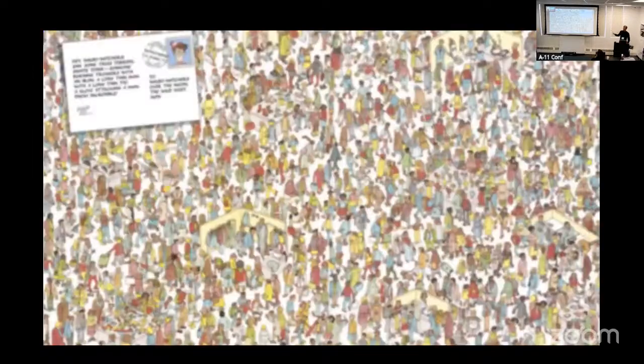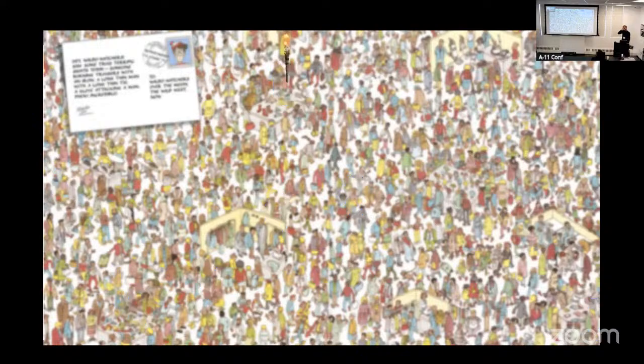So you're doing this. I always put Waldo in my slides. One way or another, and it's cute. And we're doing cryo-EM, so everything's blurred. Nothing looks like what it should. And then you pick anything that looks like a stripy thing, and you say, this is Waldo, right? And these are all the options. Some are more obvious than others, but the reality is that it would be easier if instead of picking randomly, Waldo would hold a torch or something.